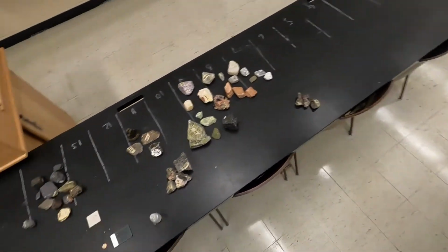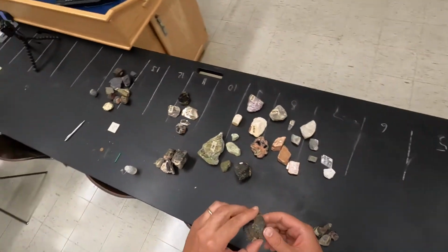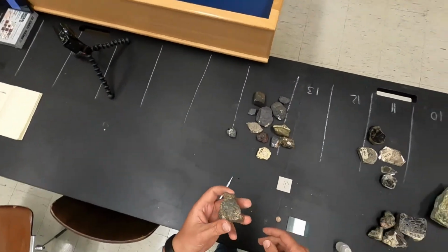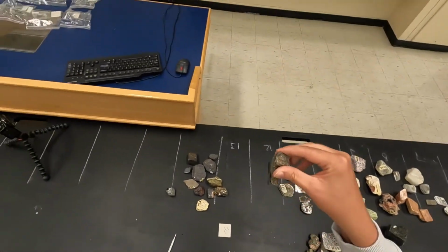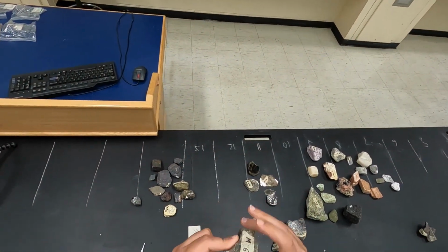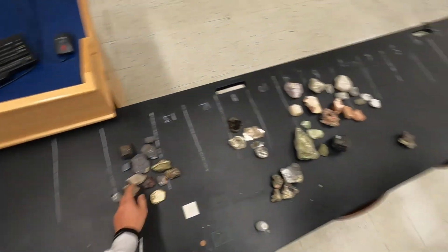Okay, so we have discussed those. Here is another piece of the pyrrhotite. So let's see if I am right. We should be able to attach a magnet, and you can see it does attach. It does have that bronze color. So definitely I would put it close to this other specimen.